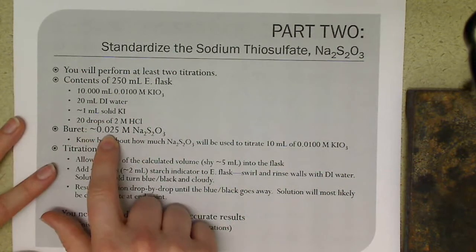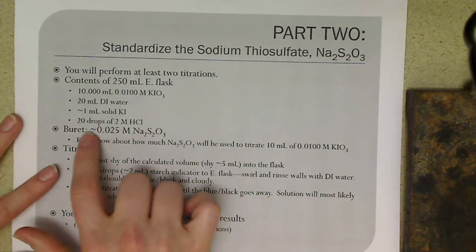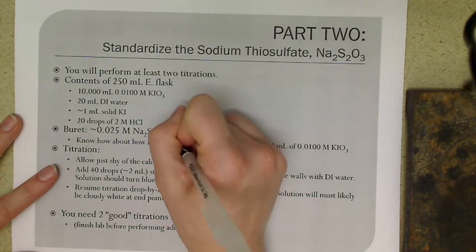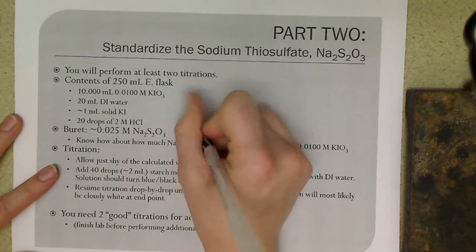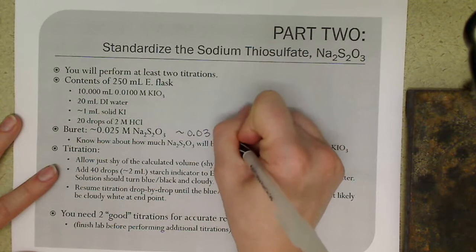In your burette, you're going to have approximately 0.025 molar sodium thiosulfate. So this is what it should be about. You want to do your calculations assuming that it's about 0.03, probably.